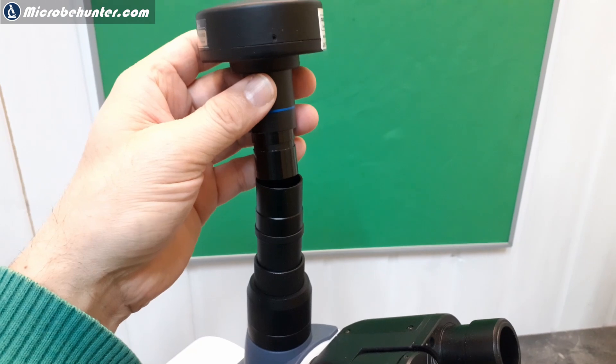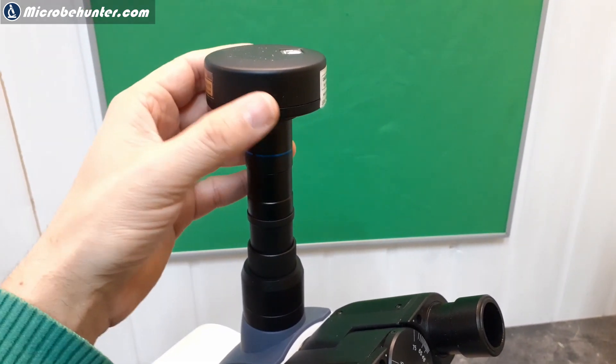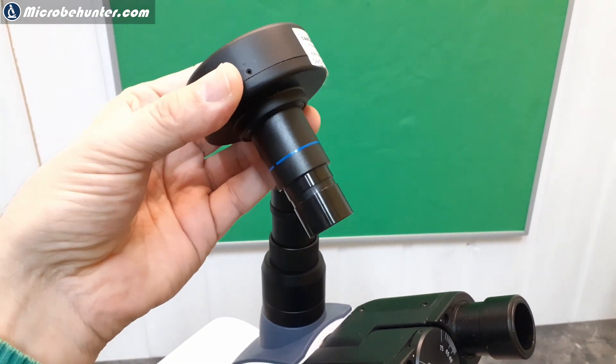The optics that are attached here, and this kind of answers already a central question, the magnification of the optics that we have here must be able to resize the image in such a way that it fits on the sensor of the camera efficiently. It shouldn't be too big and it shouldn't be too small. The magnification of the optics that we have here must be adjusted according to the sensor size of the camera and there are certain recommendations. If it is too large, it's not good. If it's too small, it's also not good. Of course, give and take a little bit. This is essentially one thing. And the second thing that the optics does by inserting it in here, the optics will pick up the image there where it is projected from the objective. The optics here, they actually fulfill both criteria. They make sure that it is par focal, focused in both cases. And also it resizes the image in such a way that it fits fully on the sensor, without wasting any pixels and without magnifying it too much.